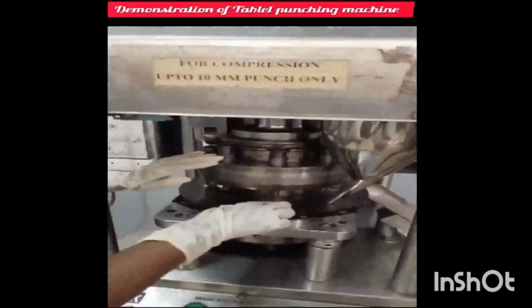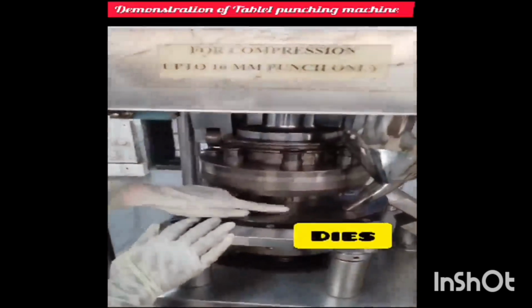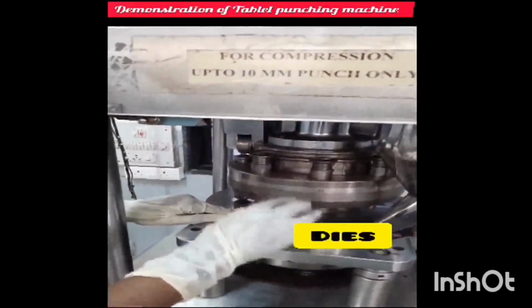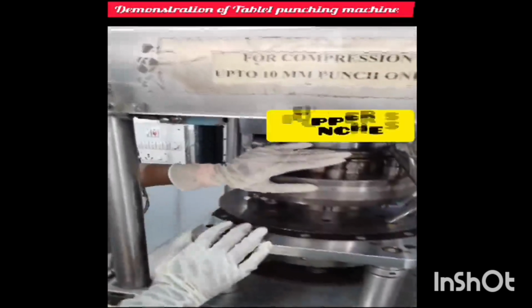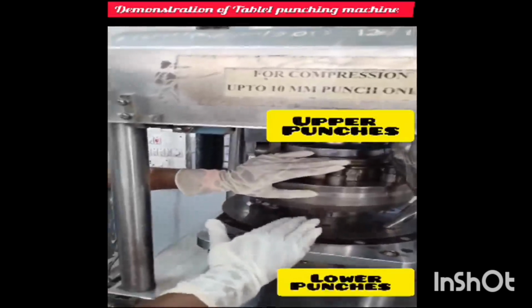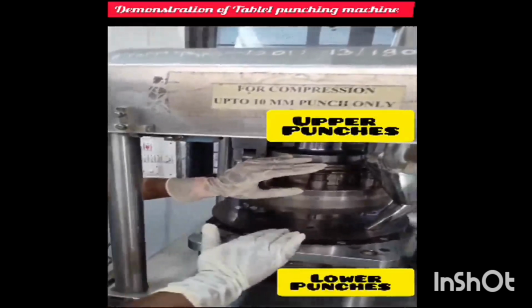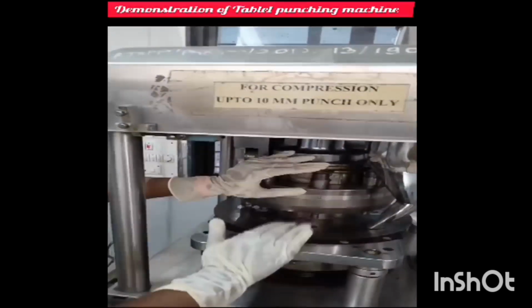Now here are the dies and punches. Dies are basically used where the feed is fed and here it holds the feed. Now here are the upper punches and downside there are the lower punches. Upper punches and lower punches help to compress the tablet by giving pressure to it.